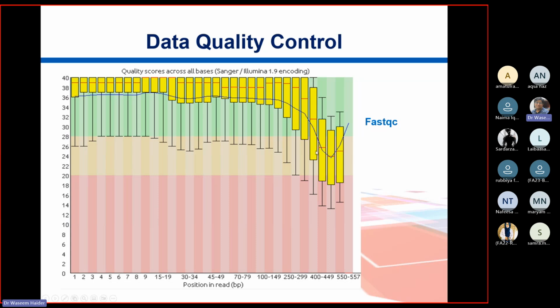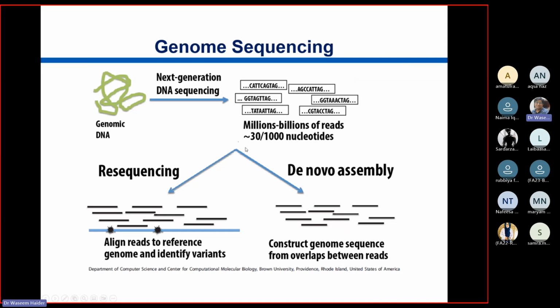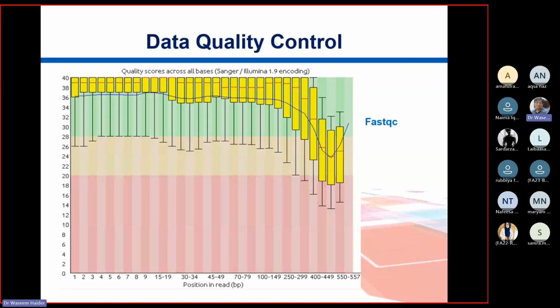Some of the boxes are very symmetric, like this one. Ideally they should be like that, but most of them are highly non-symmetric. That's why this data is not normal data. It's not normally distributed. In normally distributed data, this box plot is quite symmetric. You can see a bell-shaped pattern if you draw that distribution, we covered that, right? So here you have the lower 25% of the population, and here are obviously your means, and you're connecting the means through this line.